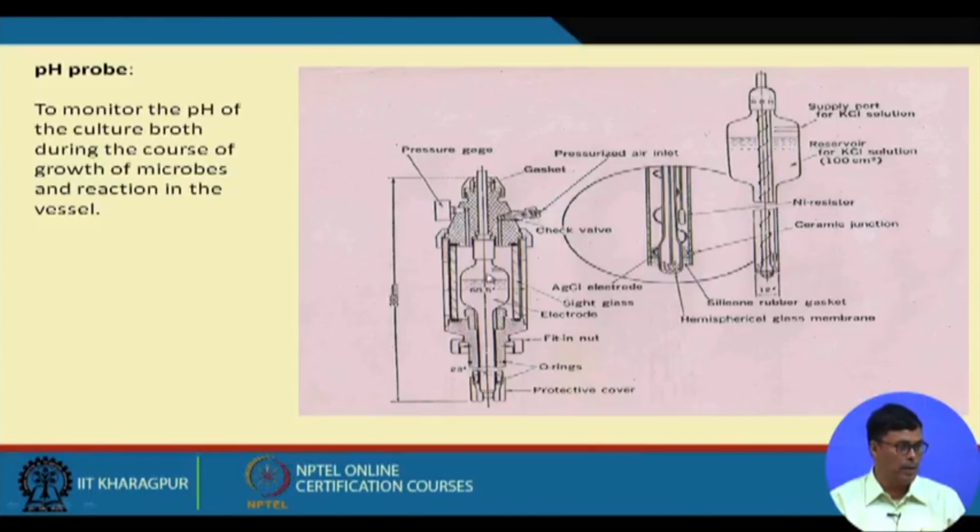If we don't maintain the pressure, the liquid can enter the porous glass, affect our electrolyte and damage the system. To avoid that, we should have 15 psi pressure above the electrolytes so that no such damage can take place. This is the special device we have in the fermenter for the pH probe.